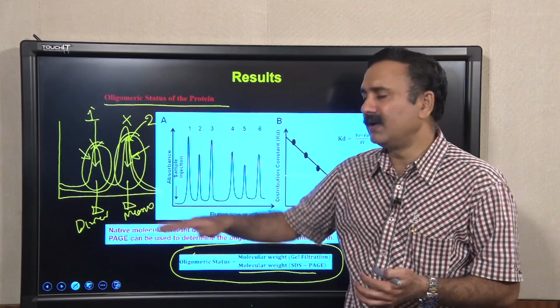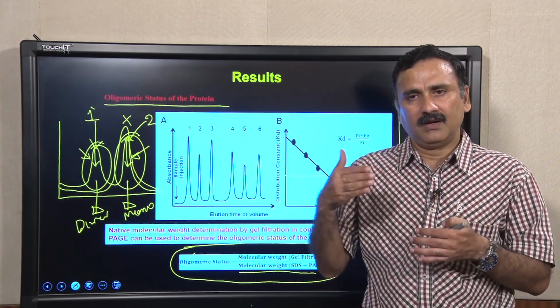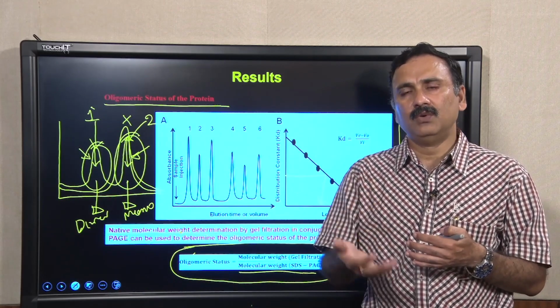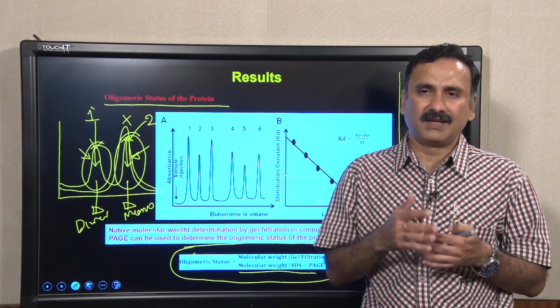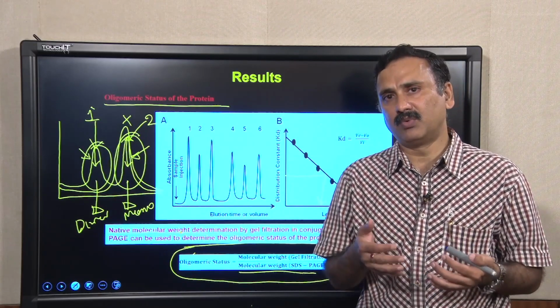So, that is also one of the strategies people plan and try, and that actually gives you successful crystallization of a protein, and it eventually gives you the structure of that particular protein.